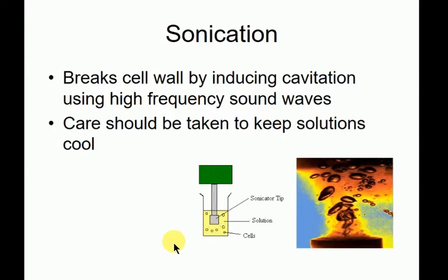And depending on how old your sonicator is and how well you've set it up and tuned it, you'll require about 7 or 8 bursts. And your efficiency is not great, right? You'll still only lyse about 70–80% of the cells. So it's cheap, it's fast, but it's not massively efficient. And it can denature the protein if you're not lucky. So if you're working on, let's say, a membrane protein complex, you probably wouldn't choose sonication.